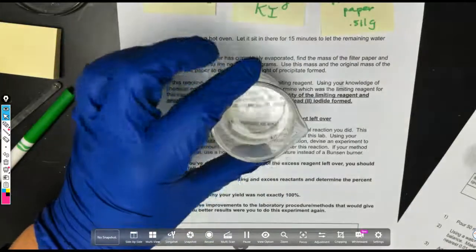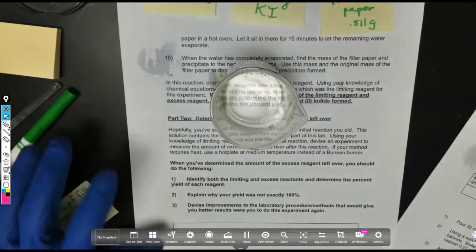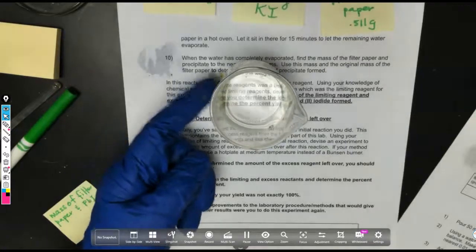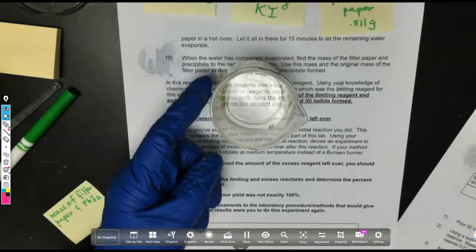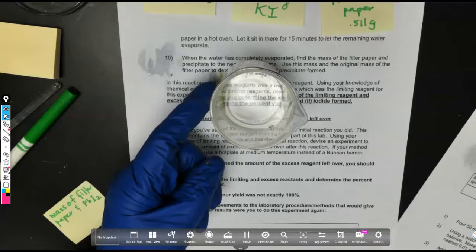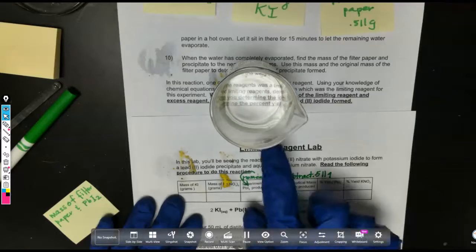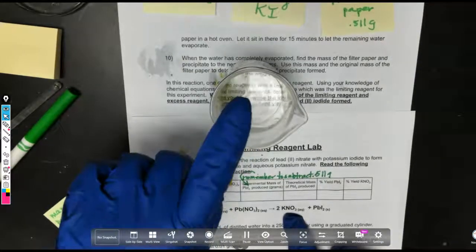And as you can see, that is just a clear liquid. And so what we want to determine is how to figure out what is actually in this solution. It is possible that we still have remaining in this solution some original excess reagent, but we also have remaining in this solution the other reagent. So far we have taken out PbI2, the solid, and removed it completely. So as you can see, that's why we have a clear liquid left.